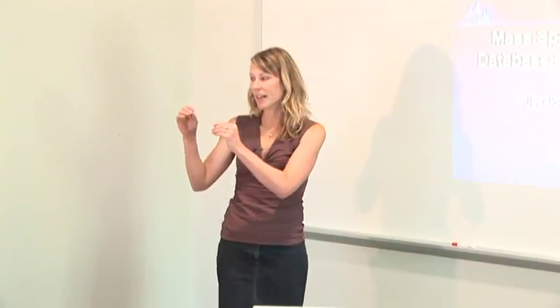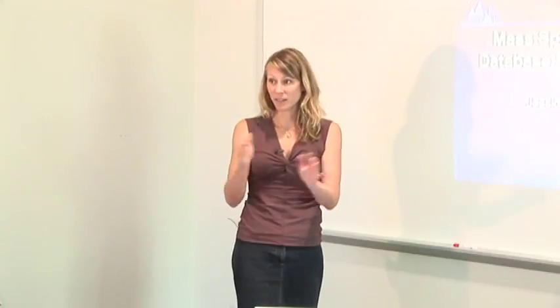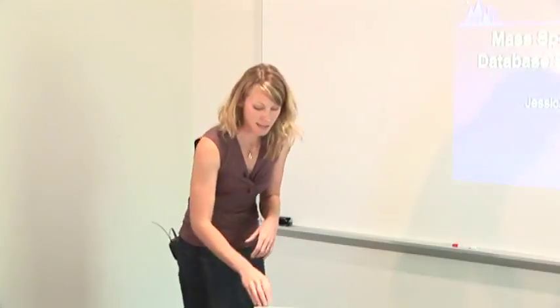But basically, the goal of the next 2 hours is to give you the basic overview of a proteomics workflow. So what are the key points of your sample preparation steps, what happens in the mass spectrometer, and then how do we deal with the data analysis. So very bare bones, very quickly, but give you an overview, and then we'll go into each part in more detail in the labs and over the next couple days.